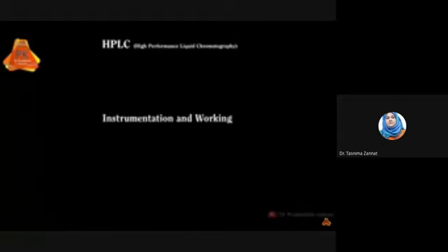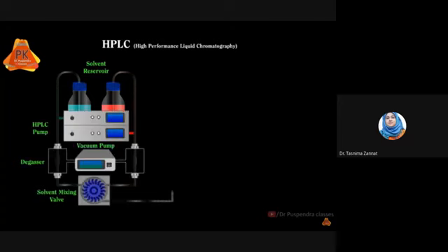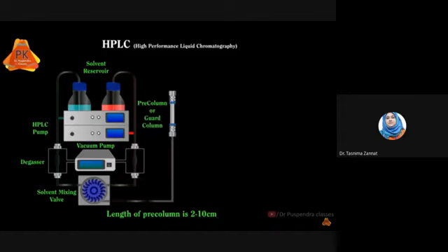Hello friends, in this animation I am going to explain about instrumentation and the working of HPLC. Full name of HPLC is High Performance Liquid Chromatography. HPLC instrument is constructed by compiling different parts which are solvent reservoir which contains different solvents, HPLC pump, degasser which is attached with a vacuum pump, solvent mixing valve, pre-column which is also known as guard column, and the length of this column is 2 to 10 centimeter and the internal diameter is 4 to 5 millimeter, usually 4.6 mm.